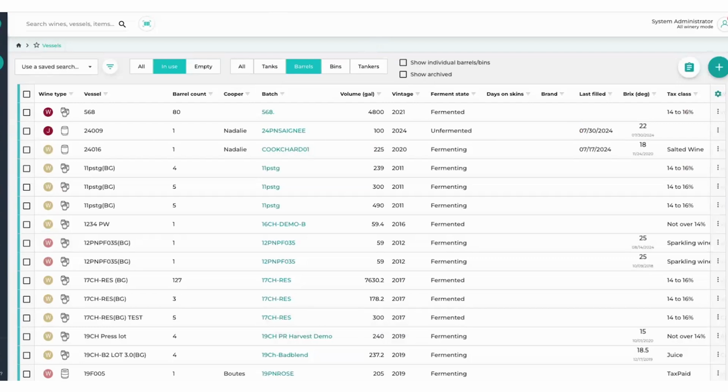Today we will cover setting up metrics, analysis templates, different ways to request labs. I'll go over our ETS Lab Integration, and finally, how to import results from in-house lab equipment. So with that, let's go ahead and get started.